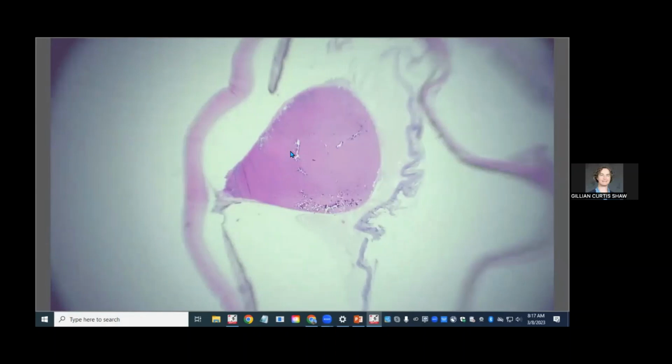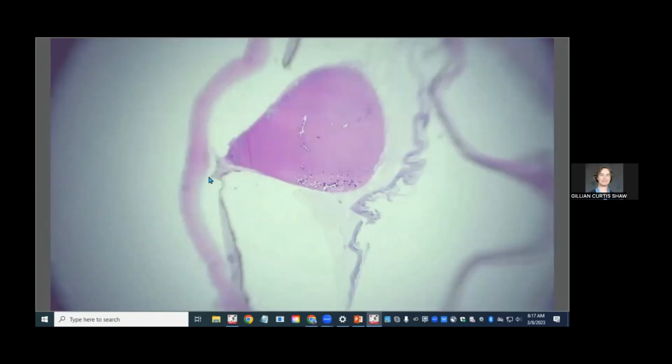Anyway, so I got multiple deeper sections of this eye because in order to sample the axial lesion, it took a few sections. But here's one of them. What we do see is that lens and a little bit of iris tissue reaching up toward the axial cornea, which we'll take a closer look at. The little spot there in the iris is a little bit of inflammation. So like many cats, there's some sort of lymphoplasmacytic anterior uveitis.